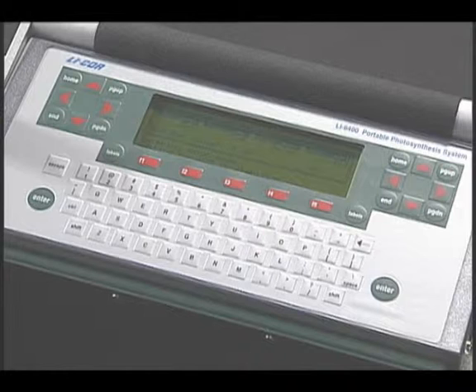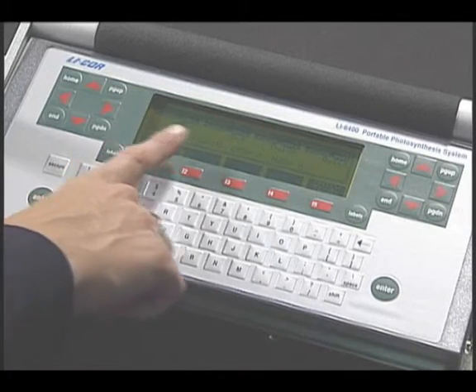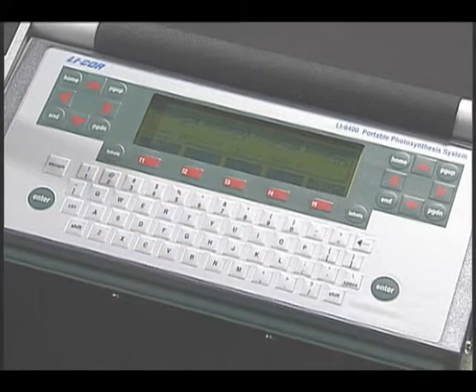When you enter match mode, the match valve will toggle and it will bring you into this menu, and it will display what your values are for CO2 and water. And what we're comparing now is we're sending the airstream that's in our sample chamber back through our reference chamber. So at that point, the infrared gas analyzers should be reading the same thing.